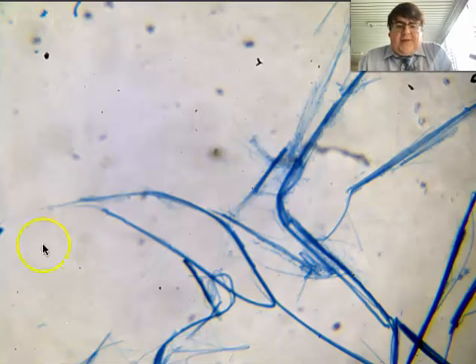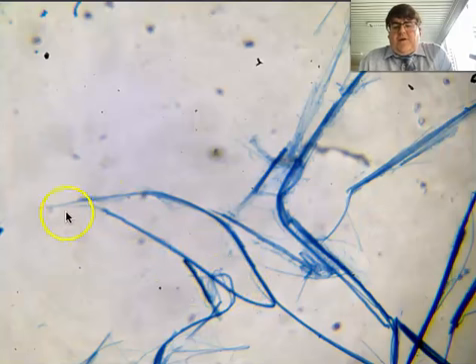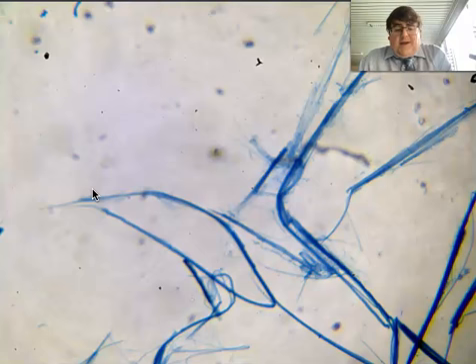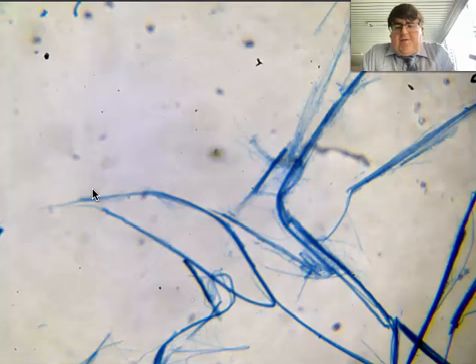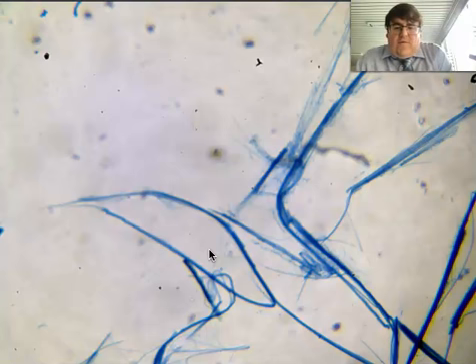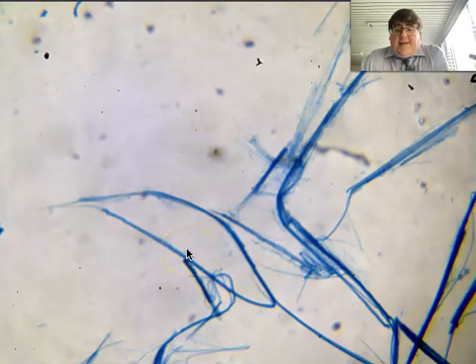Looking at the striated muscle, we can see, having a look over here, that the length of this takes up almost 1/3 of the length of our screen. Knowing that it's folded across, we could say that's roughly 2/3 of the screen. So what we need to do is, knowing that the entire field of view is 2,200 micrometers, divide that by 3, times that by 2, and we could probably say that the length of this fibre here is roughly 1,466 micrometers, or 1.4 millimeters, 1.5 millimeters. So that's the way that we calculate scale for these.